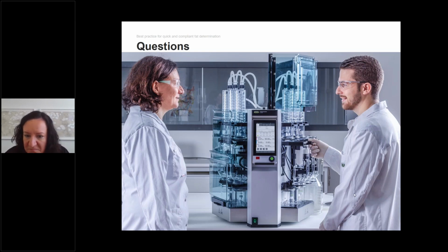There's one question about solvent for extraction. We can use 4 different solvents on the FatExtractor E-500. These are petroleum ether, hexane, diethyl ether, and chloroform. These solvents are mostly used for fat extraction. If someone has a method that demands other solvents, we have another instrument called the Universal Extractor E-500, where you can use any organic solvent, the widest range of organic solvents. So it really depends on the solvent which instrument you have to use. The solvent used for fat determination needs to be non-polar, because fat is non-polar. So normally you adjust the solvent depending on the analyte you want to extract.